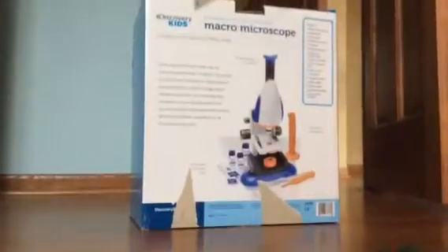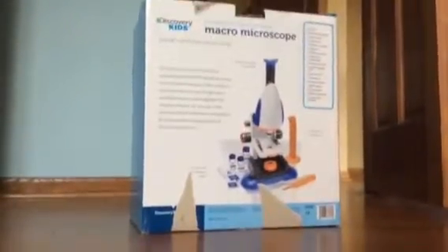Hey guys, I have had this for a while but I thought I'd give you a video on it today. We're going to be reviewing the macro microscope. So yeah, let's get started.